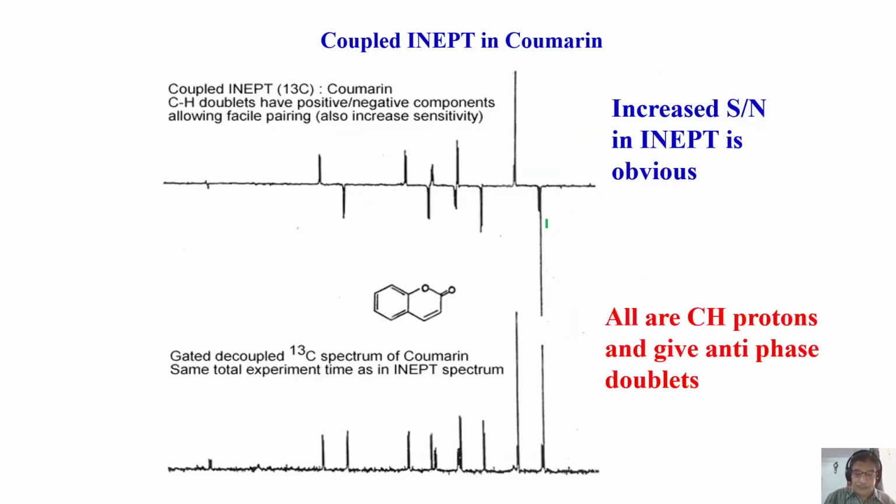Now, in the case of INEPT, we can have a coupled INEPT and a decoupled INEPT. What we have observed so far is coupled INEPT. Till now, we have not decoupled. The moment you do the decoupling, we know the signal gets lost. And this is what happens.